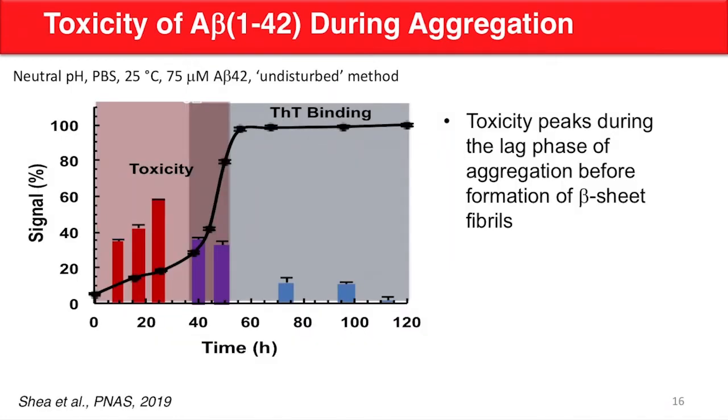Now I'm showing you how A beta aggregates over time.